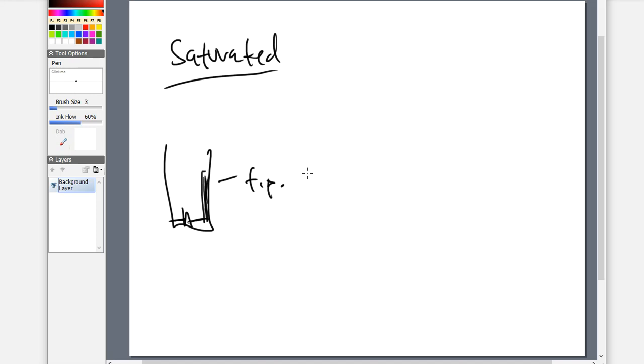Here, the lid is closed. So we put a lid on this thing after we place the pad in, after we place our developing solvent in. And then what we do is that, number 1, we are going to wait for about 20 minutes. That is the common rule that we follow when saturation development is going to take place. We are allowing the equilibrium to take place here. So all of that developing solvent has mobile phase components, and those mobile phase pieces are going to evaporate because some of them are volatile, and it's going to create a gas phase for us, and we're allowing that gas phase to be created first before we place our plate on the inside.